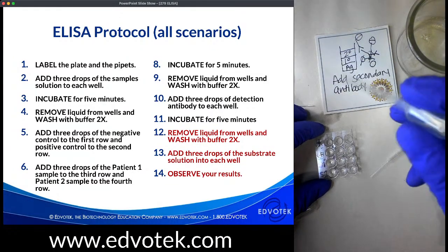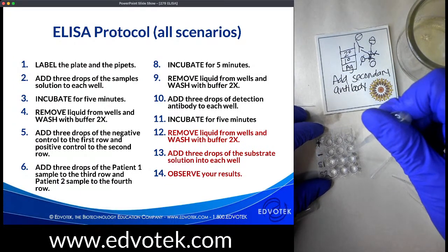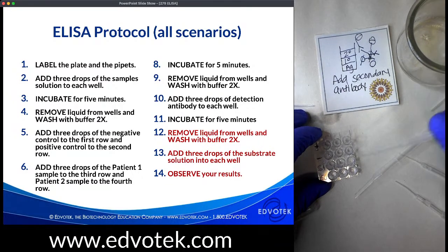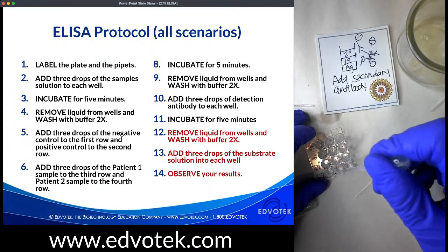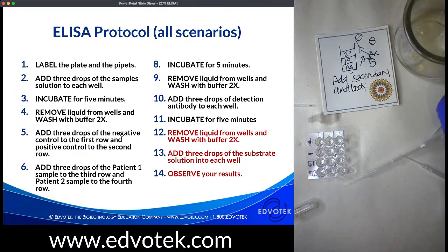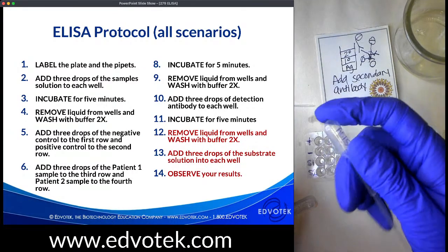And I am always a fan of hands-on experiential learning whenever possible. This is a pretty straightforward example of an ELISA, but we do have a more inquiry-based ELISA. The one that I really like is a quantitative ELISA that looks for whey. It's going to use these same antibodies, and it's going to look for milk proteins. Milk protein is a really common allergy, especially in young children, and so you have to make sure that food products don't have milk in them in order to prevent that allergic reaction. The test allows students to bring in different food products and test them for the presence of whey.